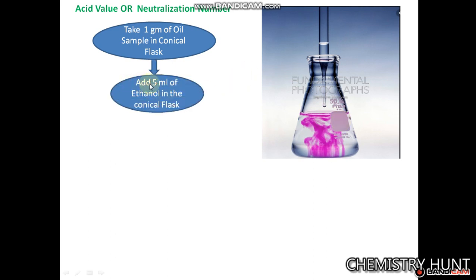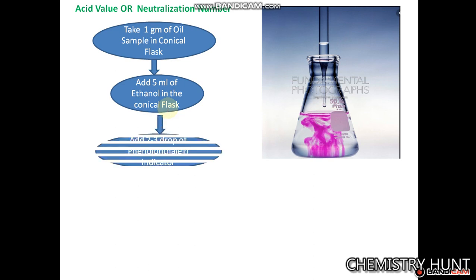Add 5 ml of ethanol in the conical flask. After that, add two to three drops of phenophthalein indicator.